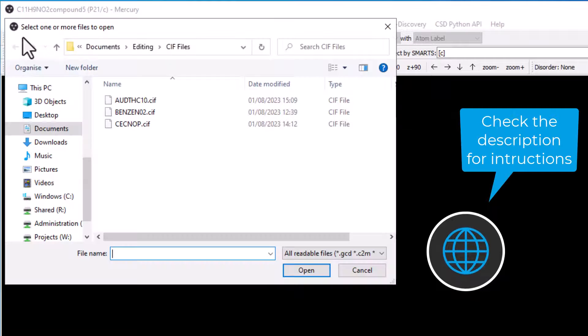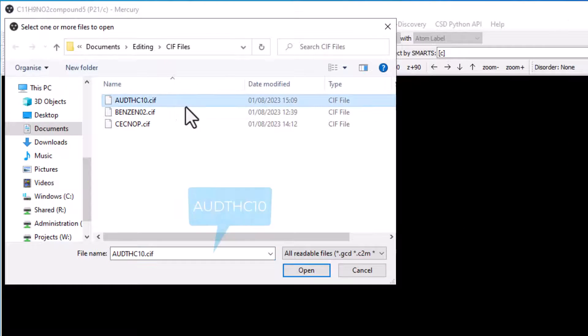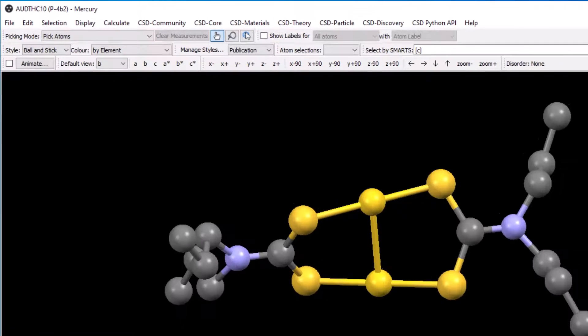From file, open the downloaded CIF file for the structure with ref code AUDTHC10.